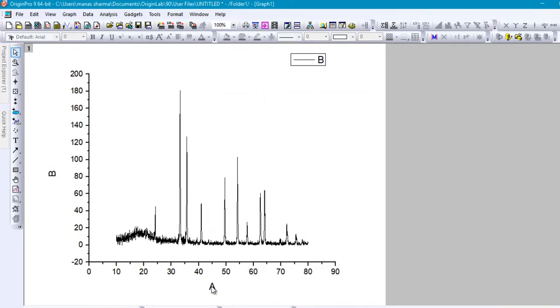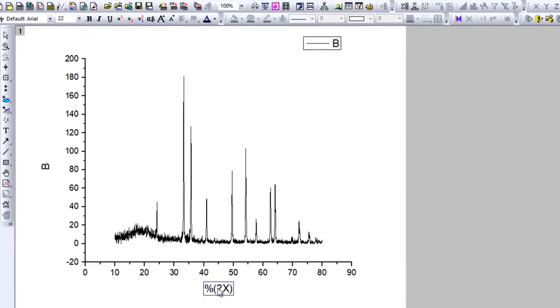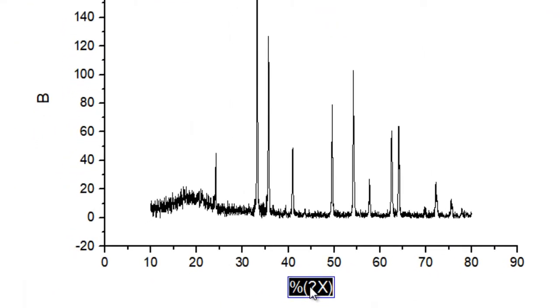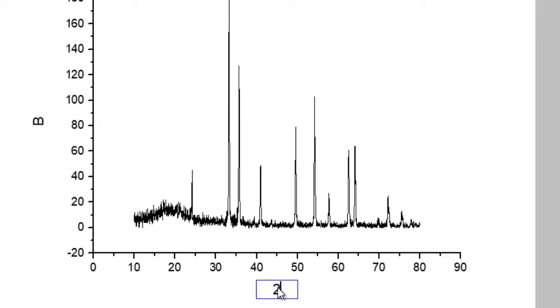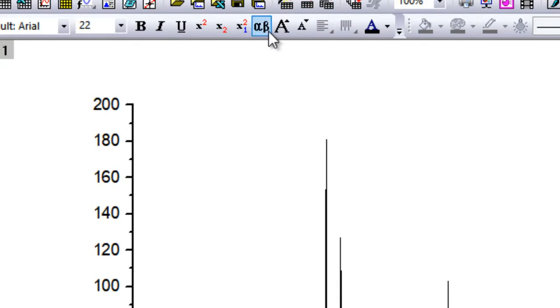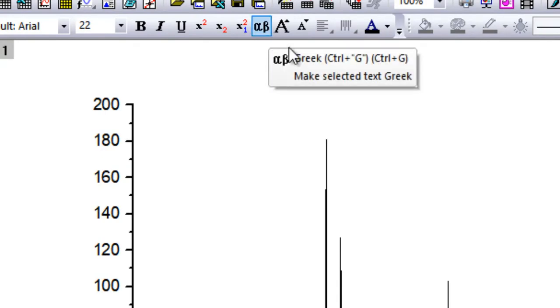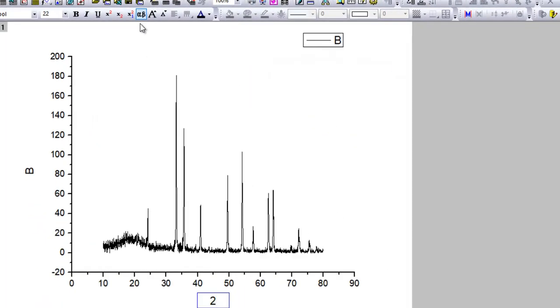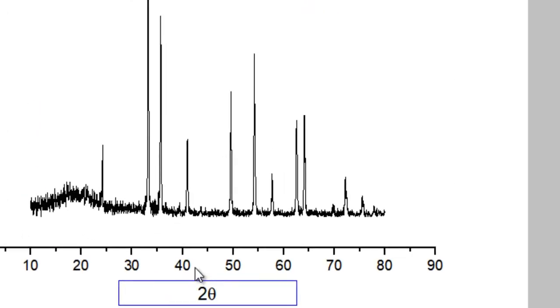The first thing you want to do is label the X axis — it should be called 2-theta. To enter theta or any other Greek alphabet in Origin, just click here or press Ctrl+G, which is a shortcut that selects the Greek format. Theta corresponds to Q on the keyboard, so if you press Q you get theta.